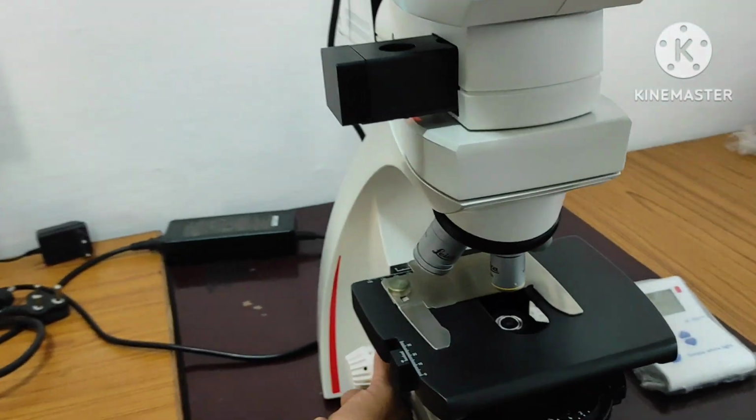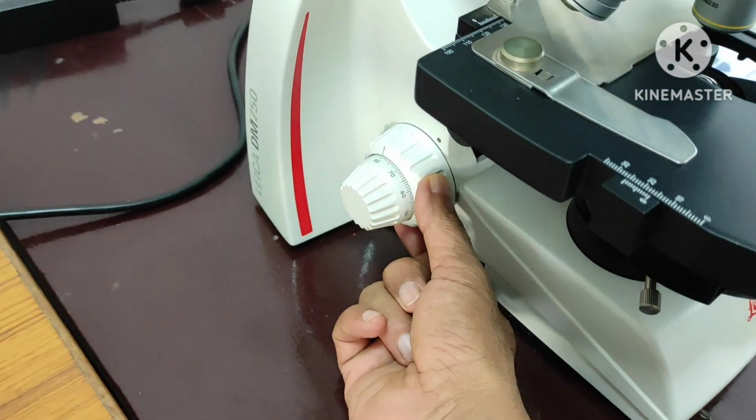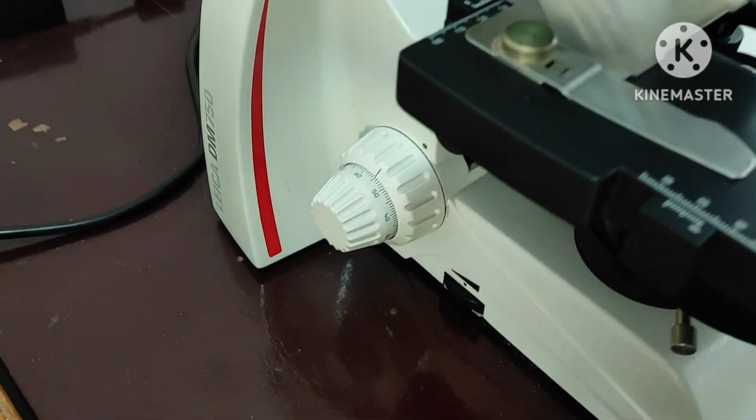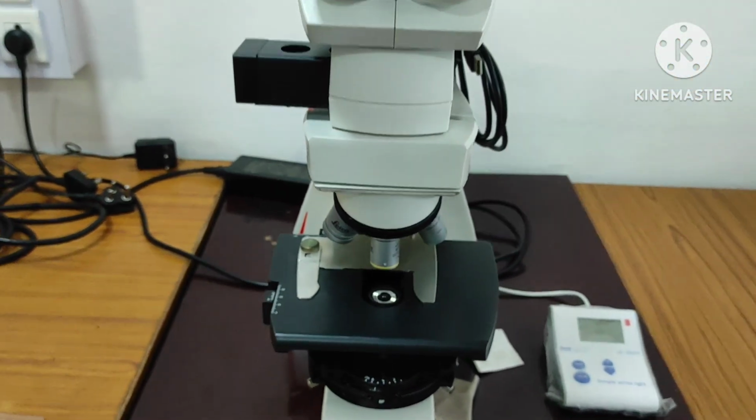These are the same coarse and fine types of adjustable knobs. With the help of that we can adjust the specimen based on distance from the objective lens, and wherever better clarity is there we can find out.